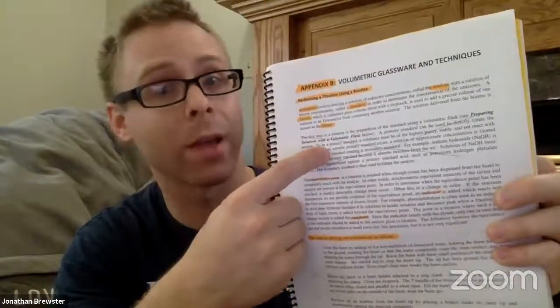It's got several different terms that are italicized: titration, standard, analyte, burette, titrant, equivalence point, indicator, end point. There's this paragraph here. You don't need to know that because our sodium hydroxide has been made for us and standardized for us. So just ignore that second paragraph there.